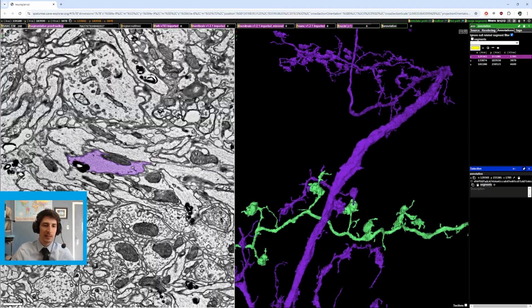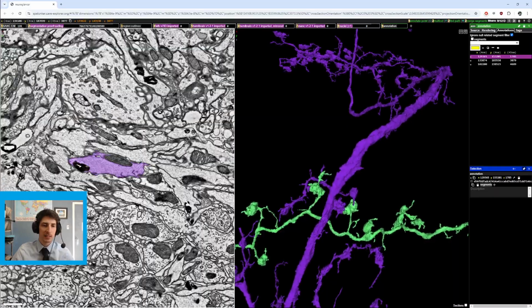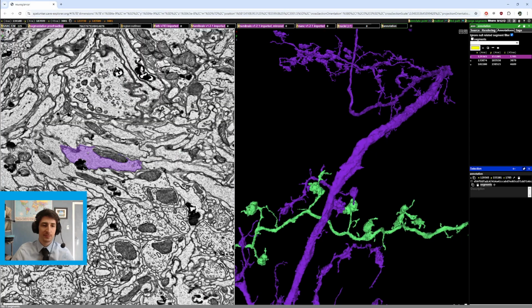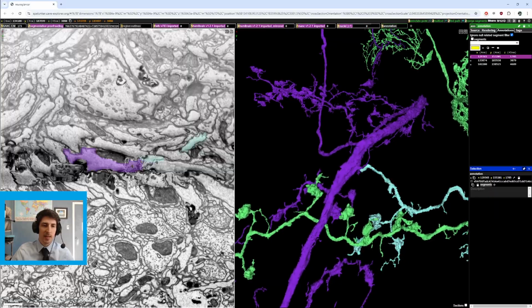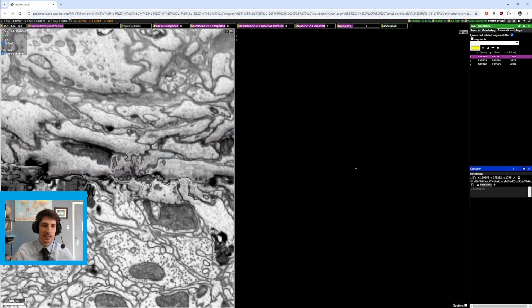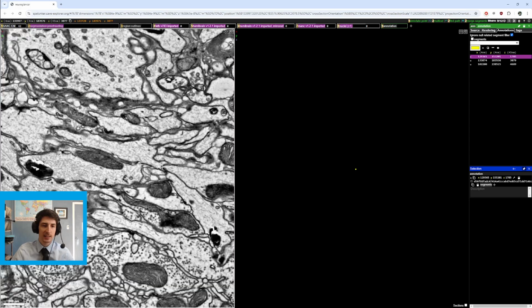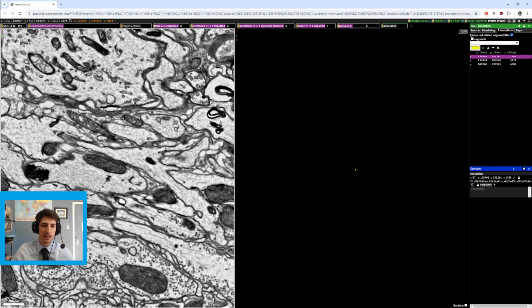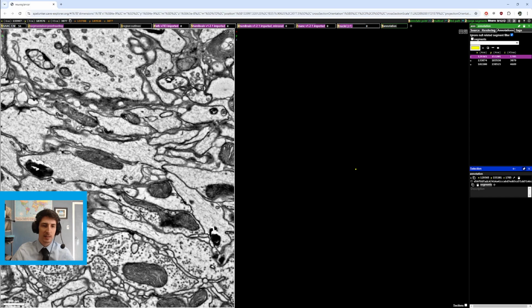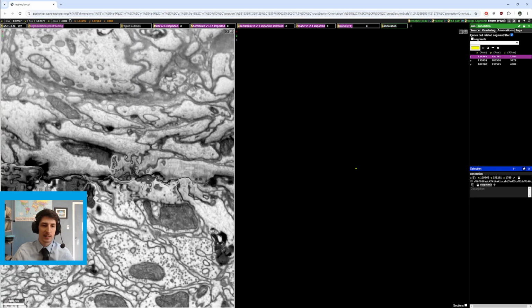But as you can see, there's this kind of thing here. And usually, it looks like it has a backbone. I'm going to click that. And it doesn't look like it goes past that. And in this slice, you could almost see that it is connecting. In this slice, you can almost see the ER is touching it. And it looks like you can see the ER right here is touching the membrane. And it's really close, almost exactly touching.